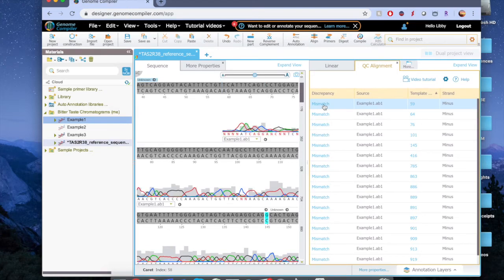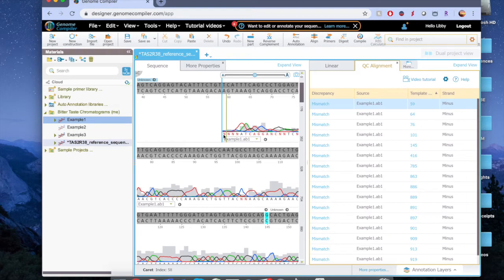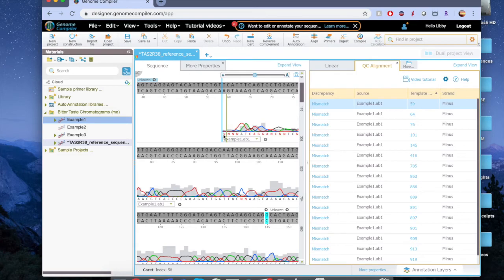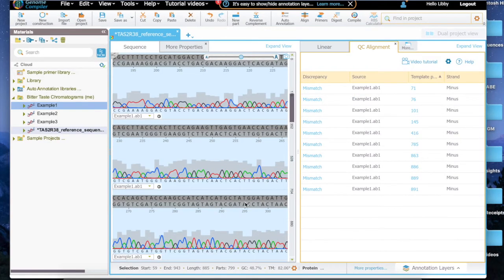Let's try this first one. Remember how we said chromatograms are less accurate at the beginning and ends? Notice the low height of the gray background. This tells us that the computer is not particularly certain that this base is correct and it's also pretty close to the beginning of the strand. It's fairly safe to say that this is just a misreading error. So now let's pick a mismatch closer to the middle of the fragment, which is likely to be more accurate.